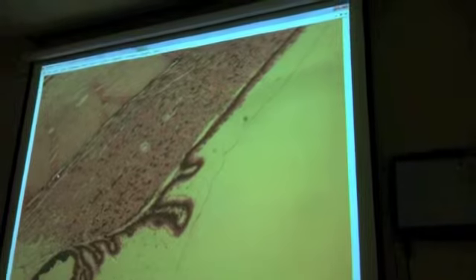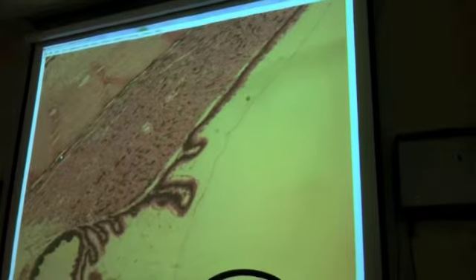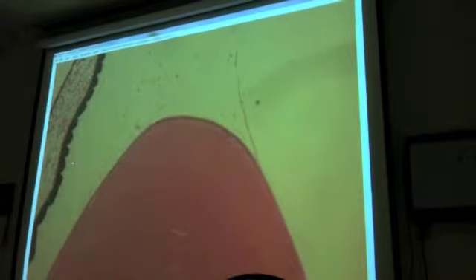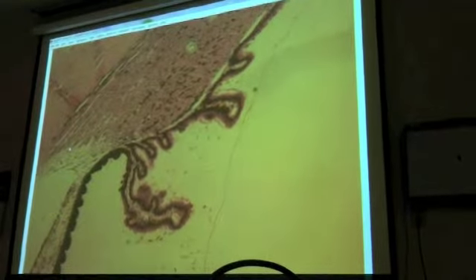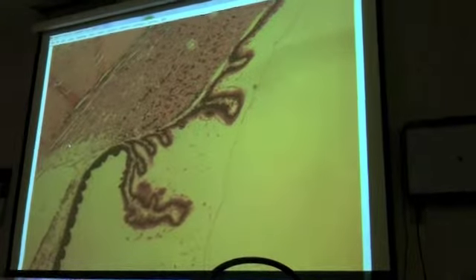And attached to these outies, or ciliary processes, are suspensory ligaments. The suspensory ligaments don't section well because they're tiny bundles of collagen fibers. We come over from those suspensory ligaments and they are suspending the lens. Okay? The lens is crystalline protein. When it's working right, the crystals are all lined up and light passes through, and the lens changes shape because the ciliary body has muscle in it. It can contract, pull on the lens and flatten it, or it can relax and let the lens ball up. That's how you go from near vision to far vision.